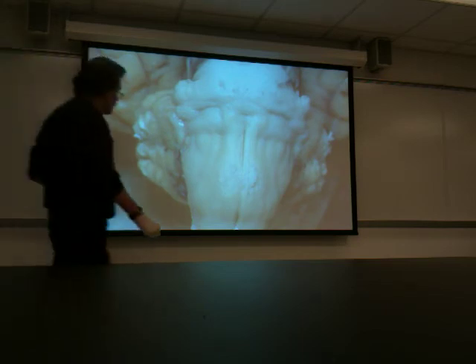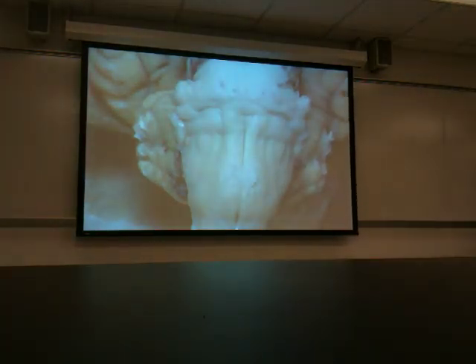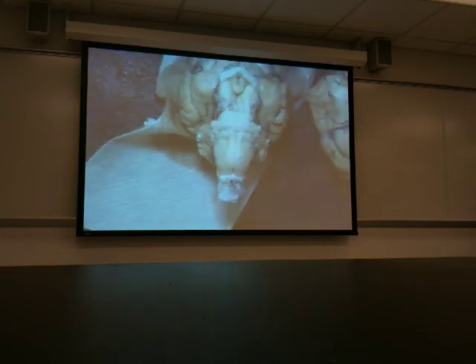All right. Ooh, that is good. Wow. Holy mackerel. Big. All right, now I'm going to zoom back out. You don't need it that zoomed in. I think you'll lose perspective.